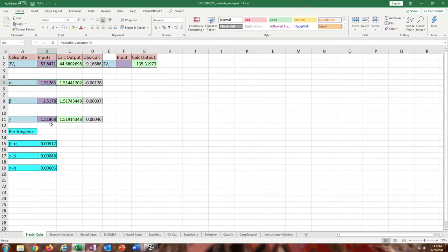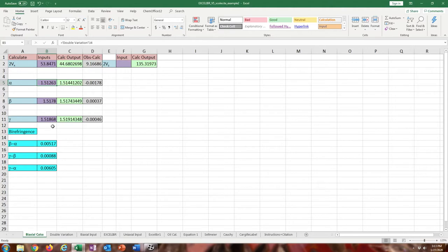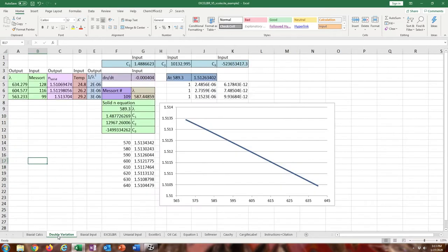What's happening is that the calculation weighting of those two that were probably more erroneous made it so that the calculation for alpha had higher error. Because it's using beta, gamma, and 2V to calculate what alpha is. But beta and gamma are probably more wrong because those weren't calibrated, because I'm lazy. Ordinarily you'd want to calibrate all of the liquids that you use, but I didn't for the one that I used for the beta and gamma measurement.